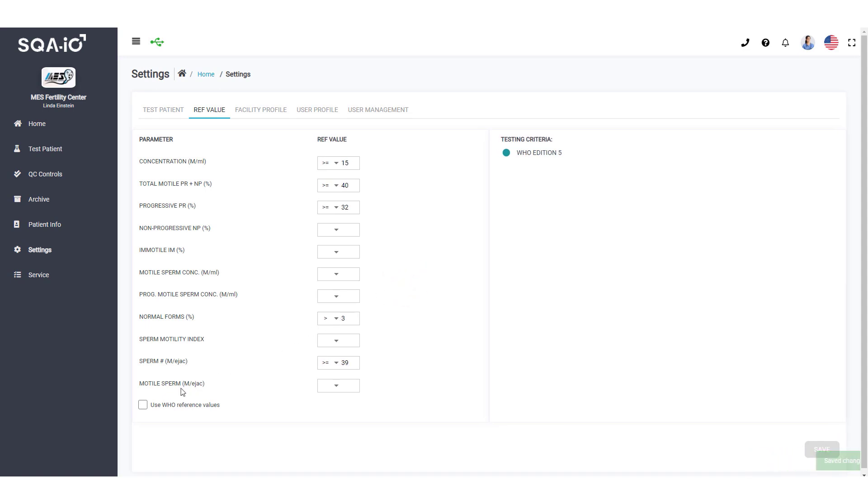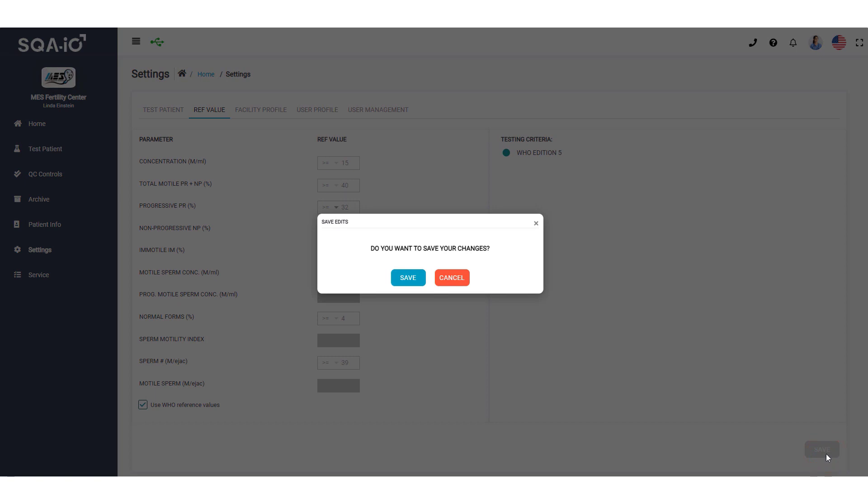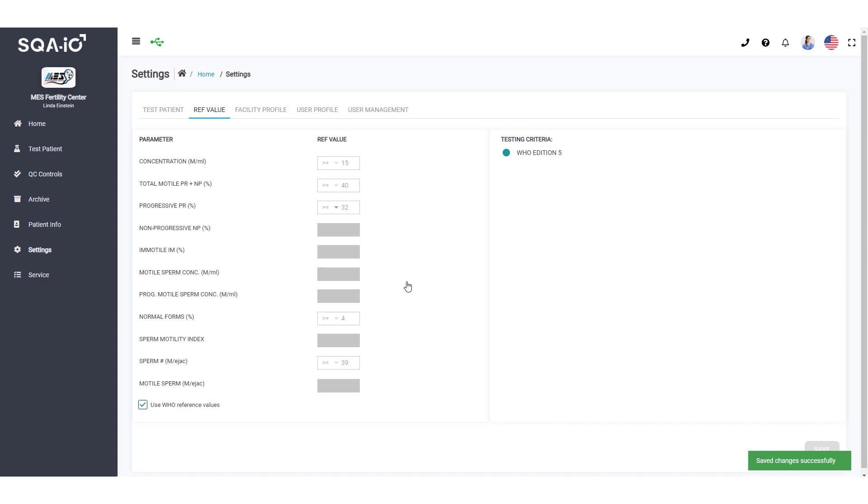Check this box to determine the WHO version used to report semen analysis test results.